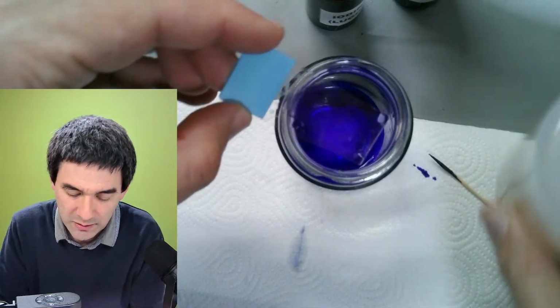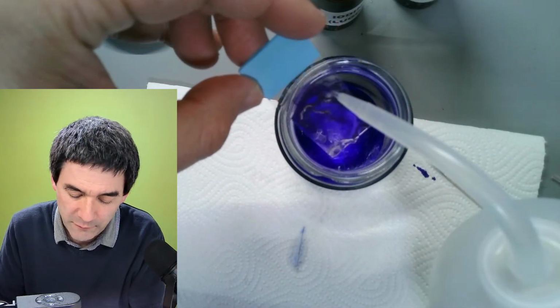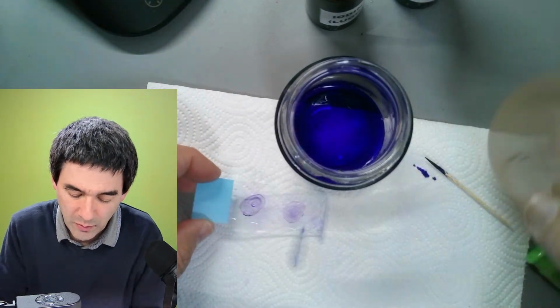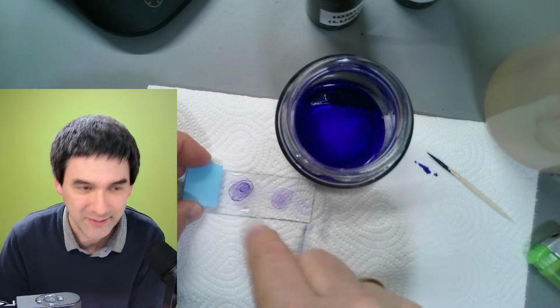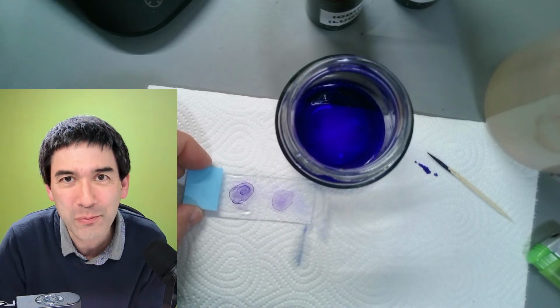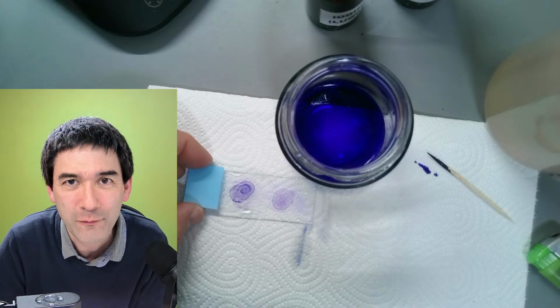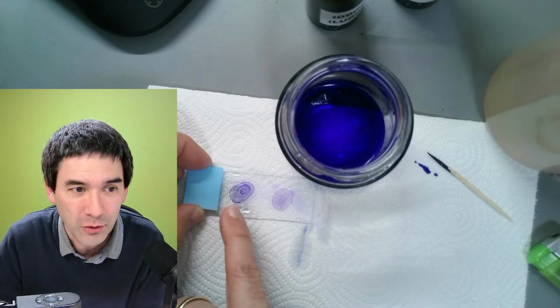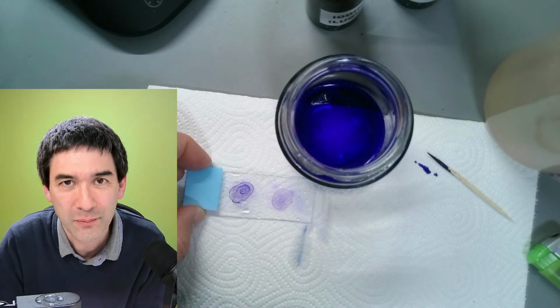Yeah, so by the way, just for your info, side info, the blueness of the stain can also be used as a measurement for bacterial density. So the darker it is, the more cells are present.